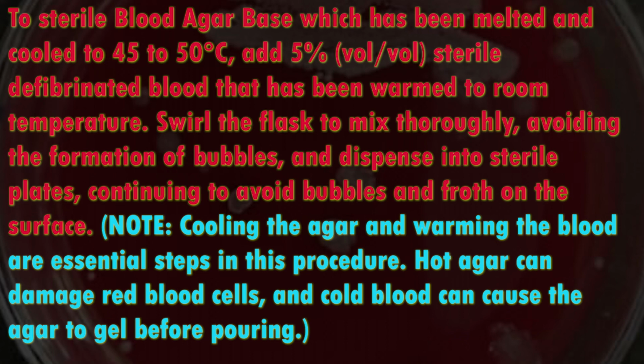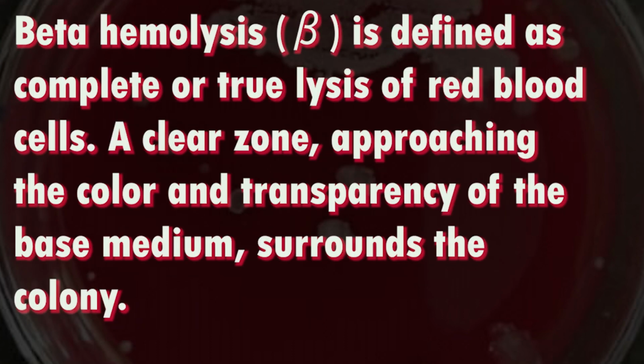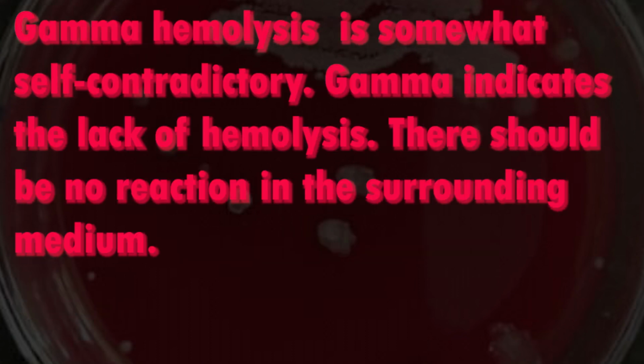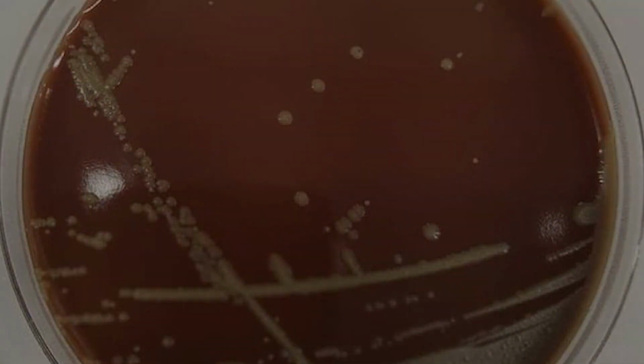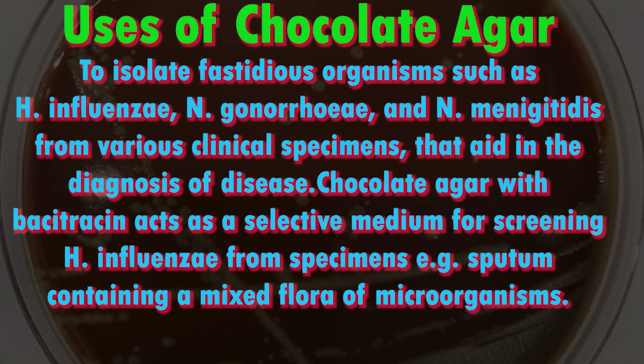Aqueous or vitreous fluid, Gram stain is important. Blood agar, chocolate agar, MacConkey agar, Sabouraud's dextrose agar, and thioglycolate medium are commonly used. Abscesses, also wound lesions and ulcers. If superficial, Gram stain is done. And again, blood agar, chocolate agar, and MacConkey's agar are used for inoculation.